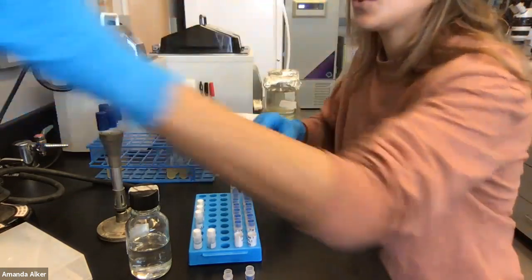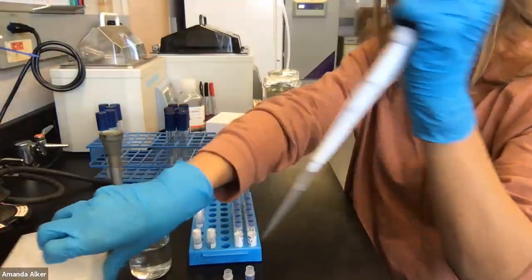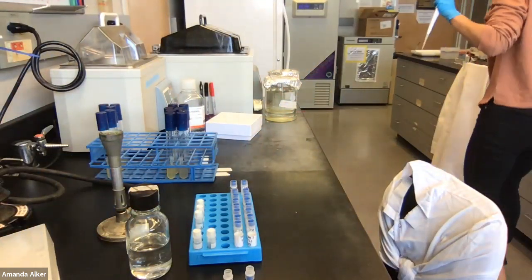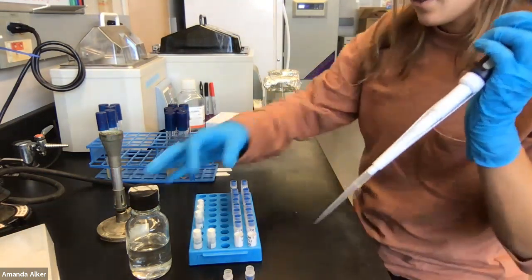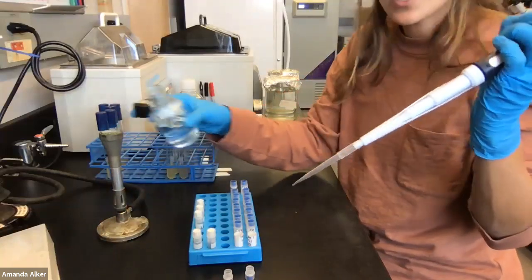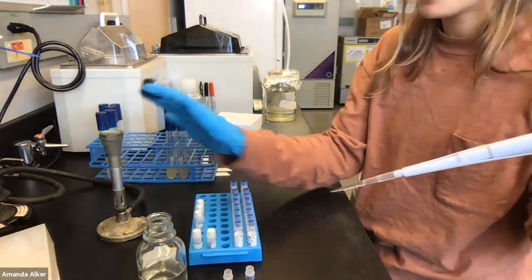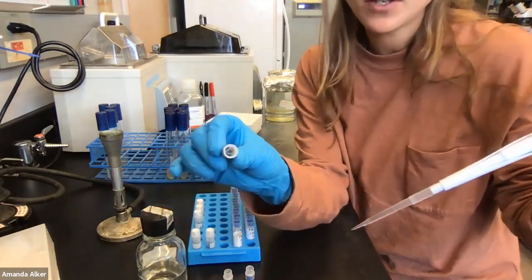Now I'm going to switch pipette tips and do this again. We could have kept the same tip on, especially if you didn't touch anything and there's nothing else in the tubes. But if we're going to be really sterile here, let's change the pipette tip. I want to make that a rule of thumb, especially when you're beginning: change the pipette tip every single time you use a new solution.